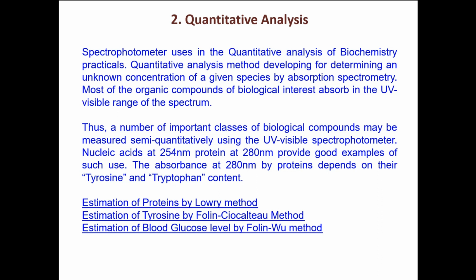So if you know this standard formula, then let's imagine in the test you got something like 0.5 OD. You are measuring the DNA concentration and you got 0.5 OD. In the standard formula, 1 OD is equal to 50 micrograms of DNA. So now I got 0.5. Then what will be the concentration of my sample?